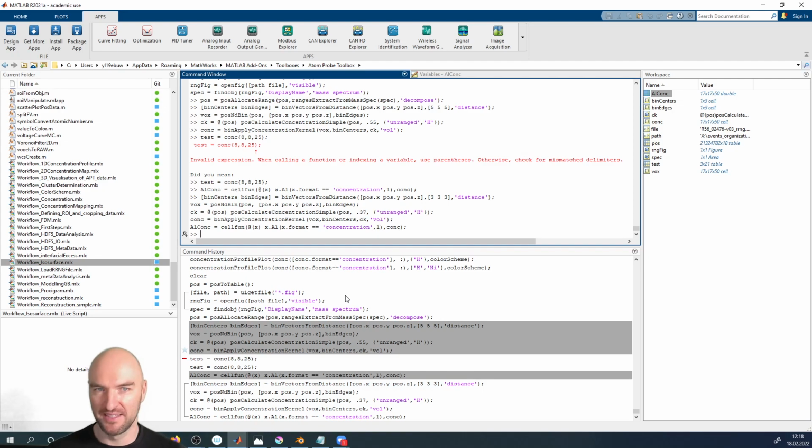Yep, all done. I should have probably also added some time measurement to that. And you can see now we have a voxelization that's 28 times 27 times 82. So that's a lot more.